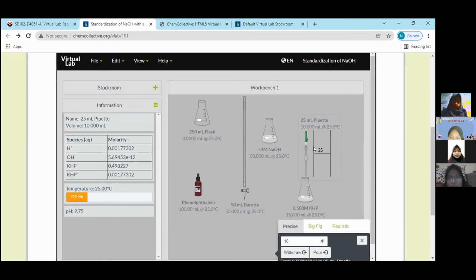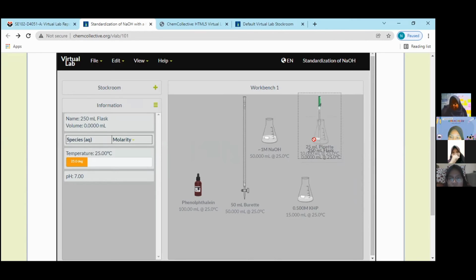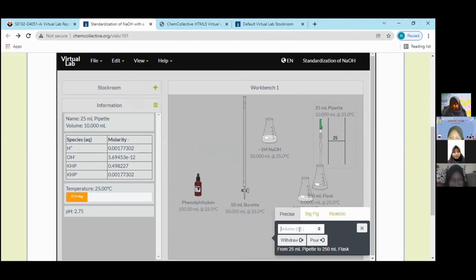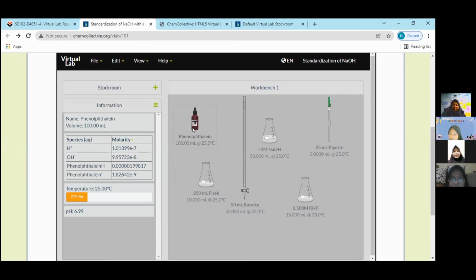Ten milliliters. After that, the procedure will be explained by Khaliza. Please, Khaliza. Okay, thank you, Jihan.